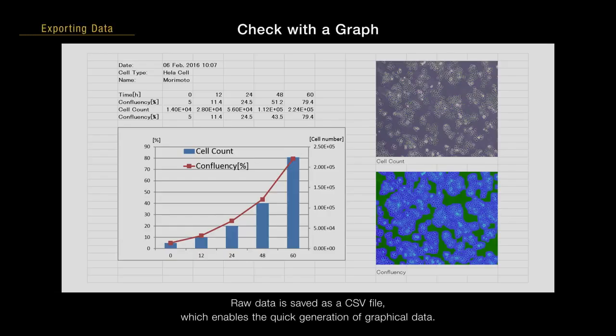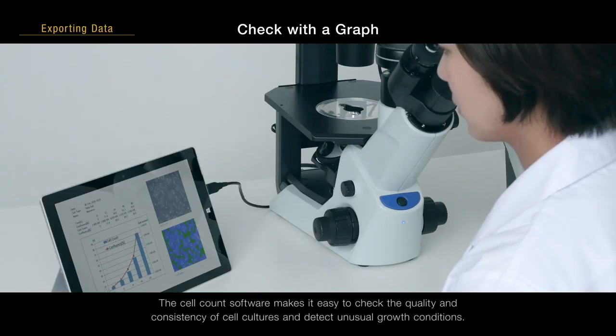Raw data is saved as a CSV file, which enables the quick generation of graphical data. The cell count software makes it easy to check the quality and consistency of cell cultures and detect unusual growth conditions.